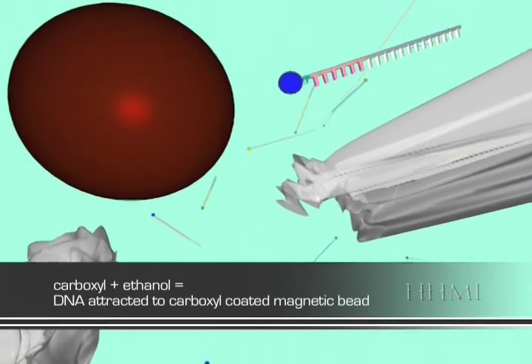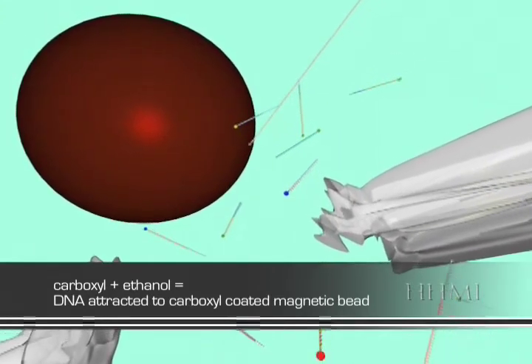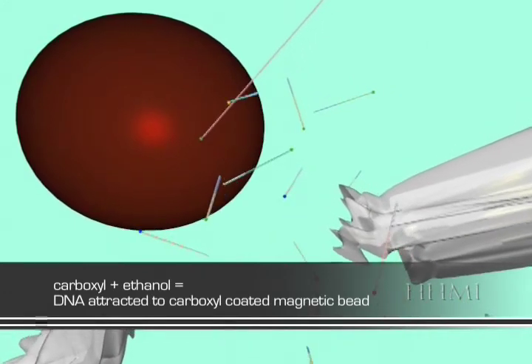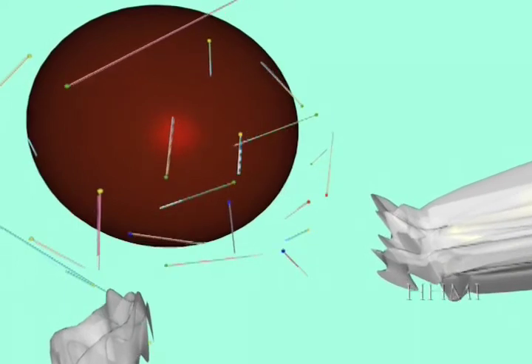The carboxyl coating on the beads only sticks to the DNA. All the other bits of cellular debris and reagent remain suspended in solution.